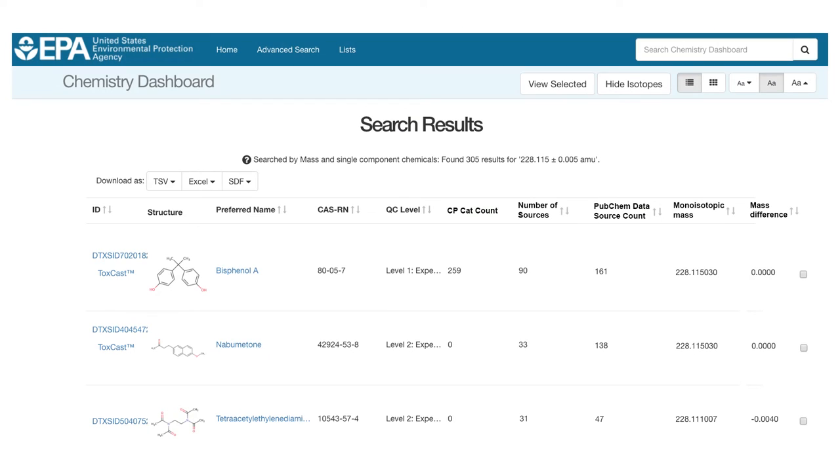The CompTox dashboard uses a ranking approach similar to that of the popular database ChemSpider. Both order search results according to how frequently a target compound occurs in different data sources, including scientific articles and patents.